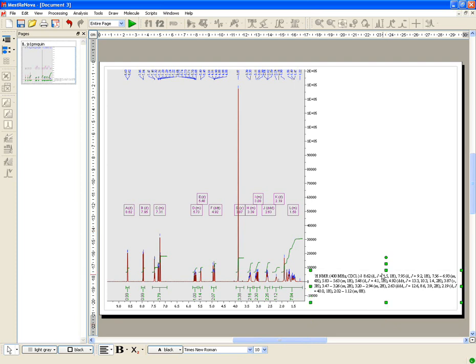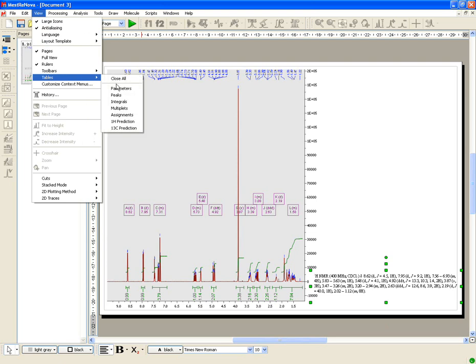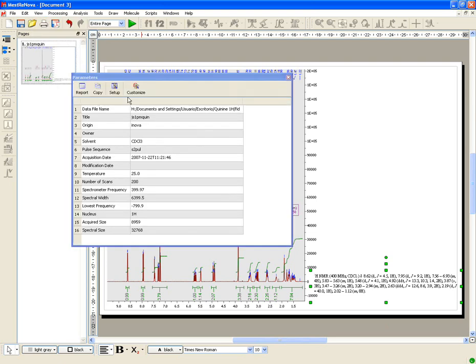To paste the table parameters on the spectral window, just select in the View menu Table and click on the Report icon.